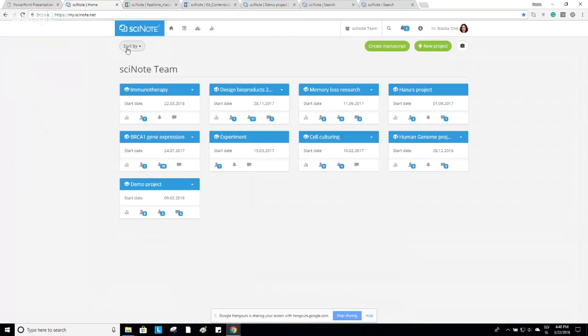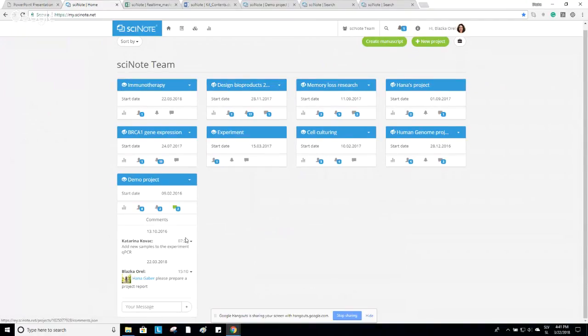Okay, so the next question is, or perhaps integration with Slack. So this is the question which was probably in connection with some other question. Integration with Slack. So maybe I can answer this question. We have thought about it because in our company, we also use this for internal communication. We like this app, but currently you can just use all the fields that offer the comments, and you just tag a person with an at sign, and this is the current sufficient functionality in regards to communication.